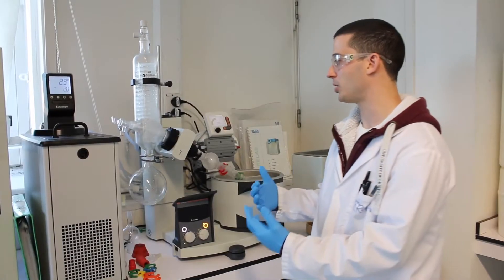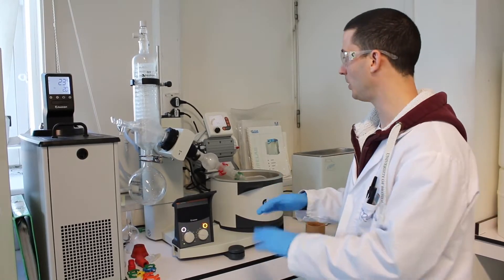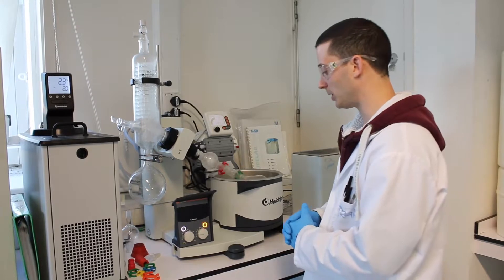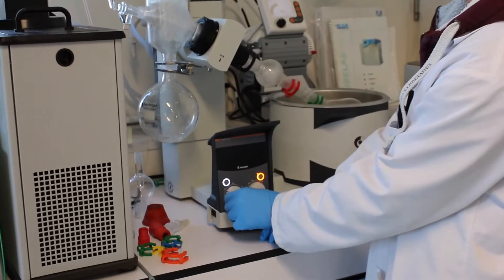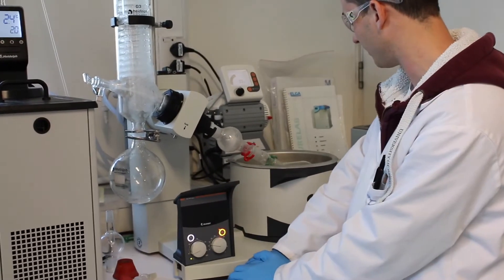So when the operation is completed, this is what you need to do to switch off the instrument and remove the flask from the rotary evaporator. First thing, you want to turn off the spinning and lift up the flask from the bath.